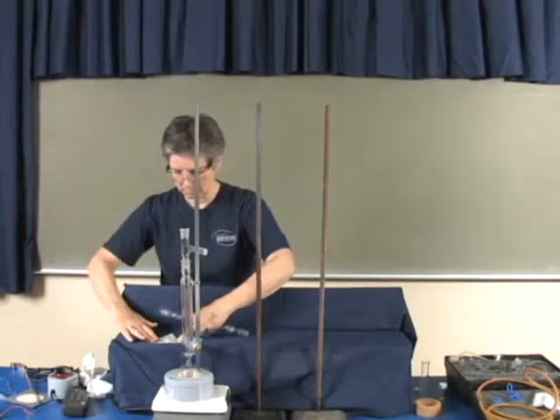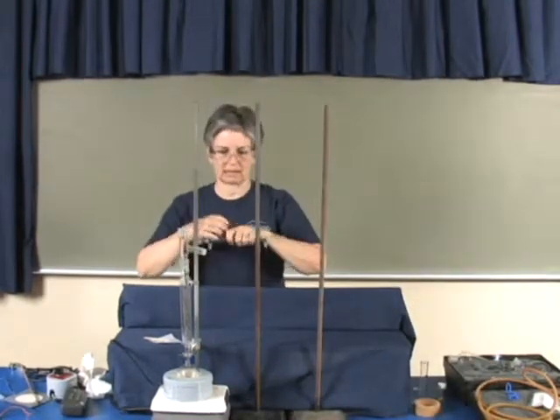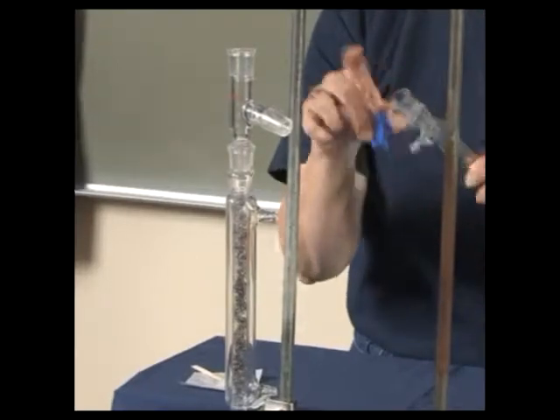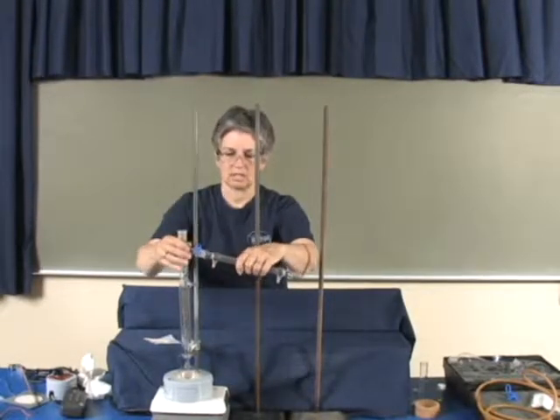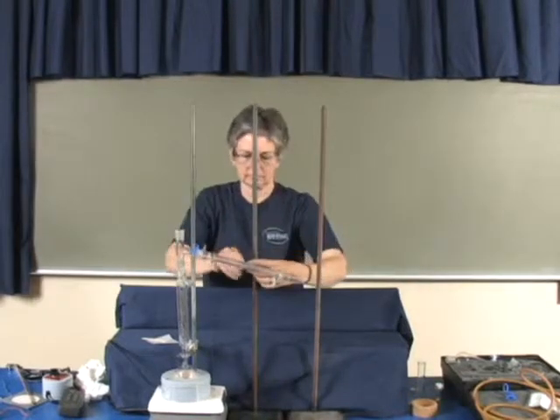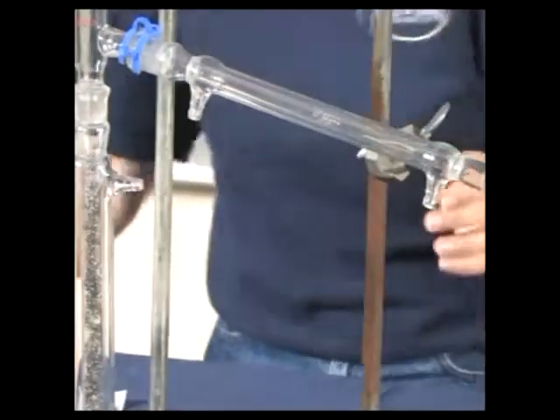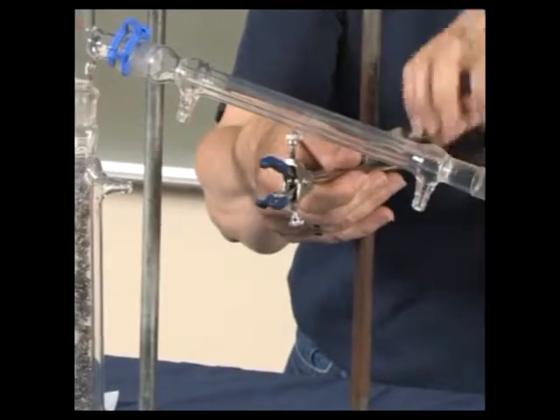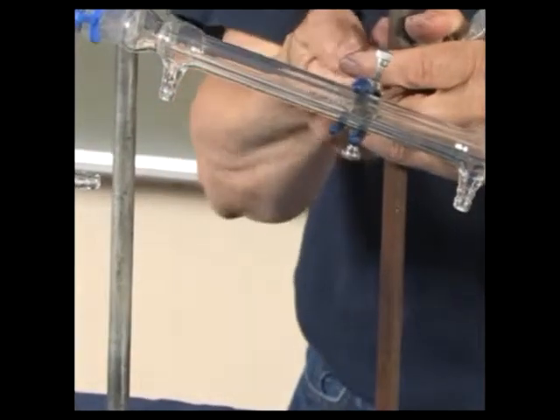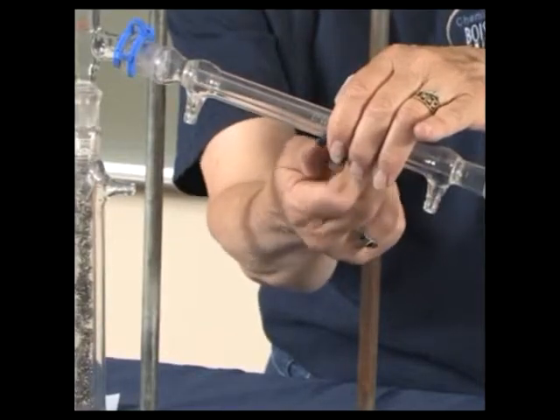Then the condenser column is attached to the distillation head and secured with a keck clip. On the keck clip, the larger side of the clip goes on the outside of the large piece on the glassware. But still, just to make sure that that's secure, it's a good idea to put a clamp here for extra security. The 3-finger clamp works well. This clamp should not be tight, so you don't put pressure against the joints, but you want it there for support of the condenser.